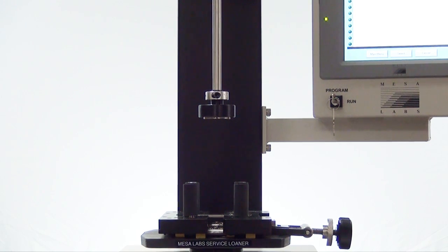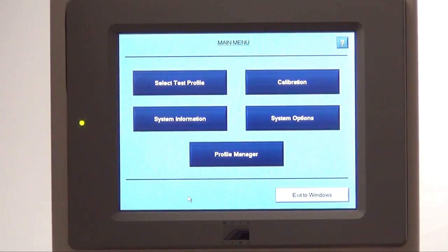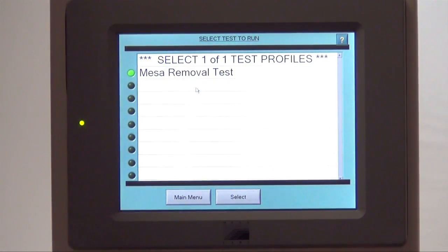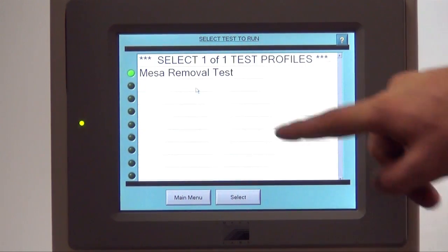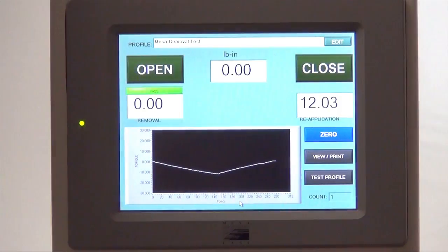Once you have the tooling properly installed, you are now ready to perform testing. From the main menu, hit the select test profile tab. This will take you to your test profile menu. This menu will show all the test profiles that you have entered into your Torco system. For this example, we will use Mesa Removal Test. Select Mesa Removal Test and hit the select key. This will take you to your main testing menu.